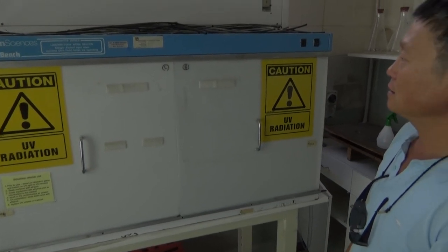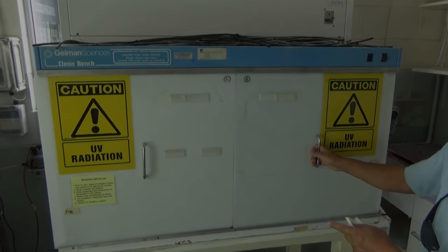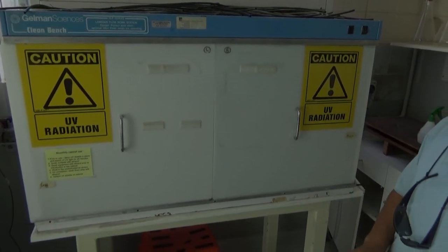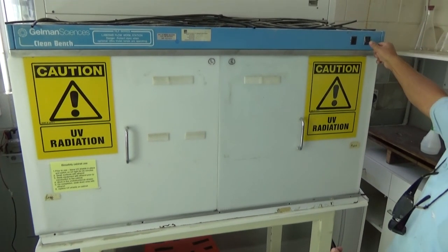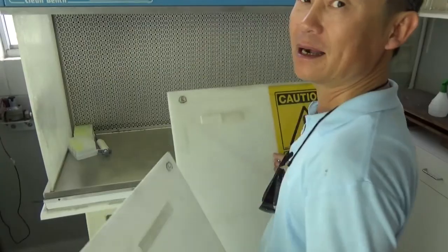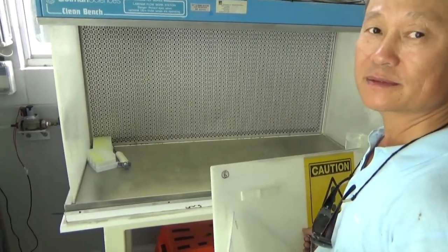Press UV on. You can see UV light is on. But don't look at that, it will burn your eye. And leave for 20 to 30 minutes. And after that, push this one down. Open that. We can open that up and then do the transfer.